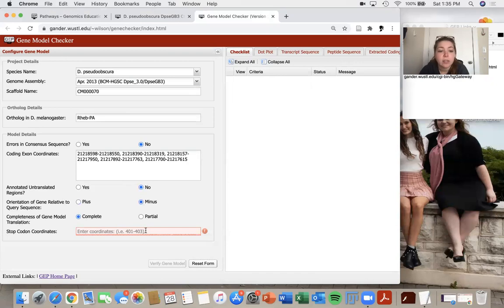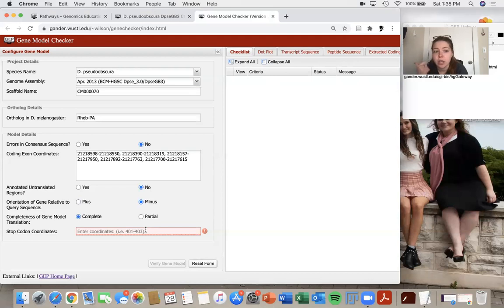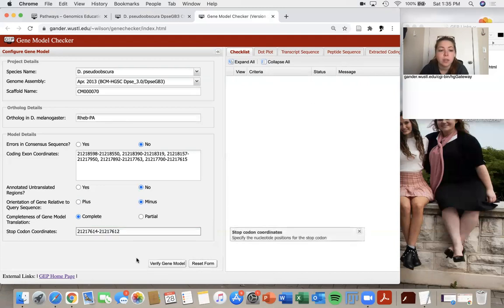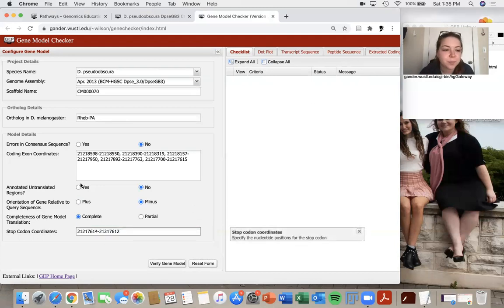And then the stop codon coordinates will automatically fill themselves in if I have the correct orientation and all my coding exons filled in. So if I click in the stop codon coordinates box, they should automatically fill themselves in. So that's just a little trick.